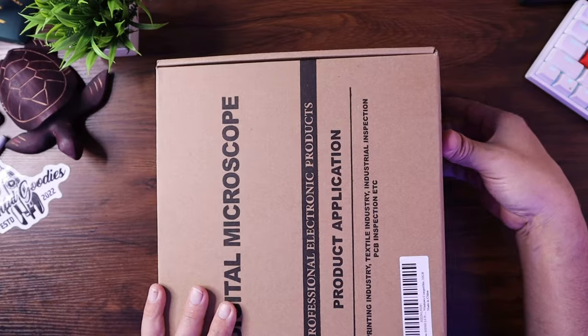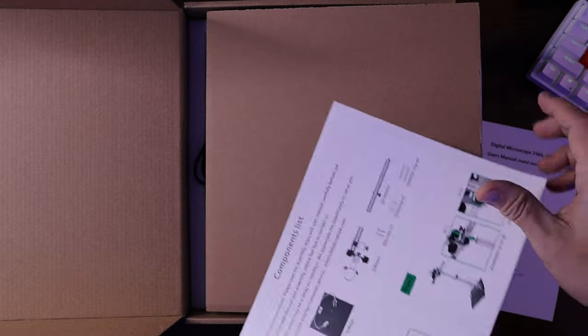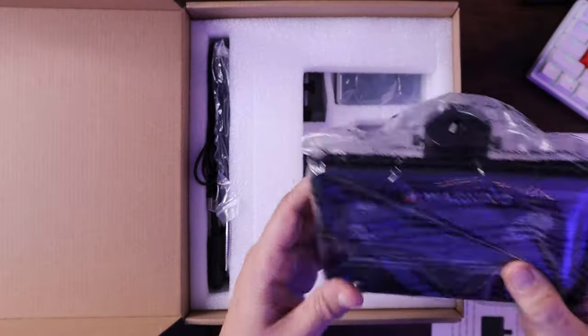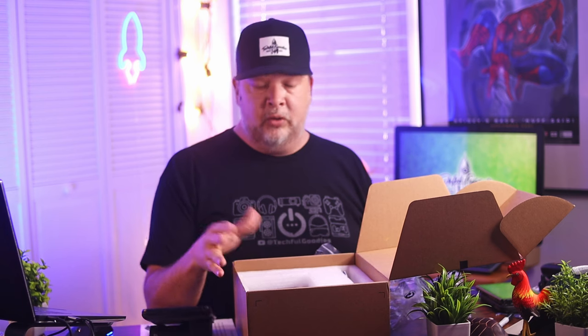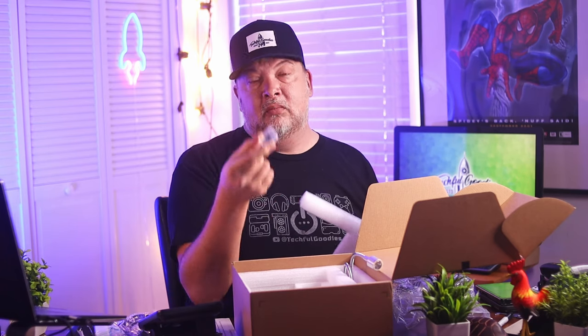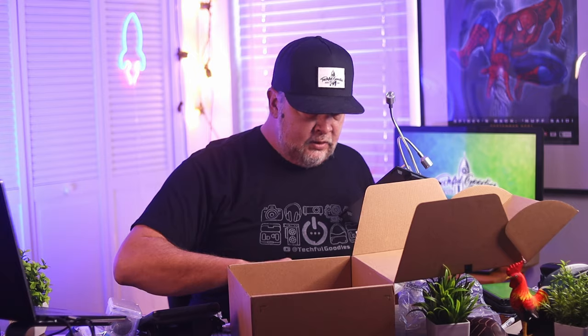So in the box, which is a pretty big box, you have a manual, setup instructions, the screen that goes with it, and different connector cables. By the way, this is actually going to be a long setup process, but I'll put chapters in here if you want to jump forward to when it's assembled and see how it actually works. There's also a remote control, a small SD card for capturing video, more cables, the base station itself, and connectors.